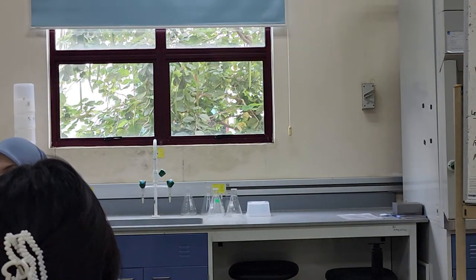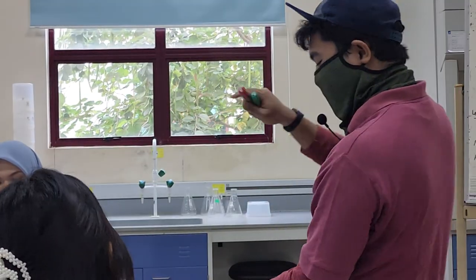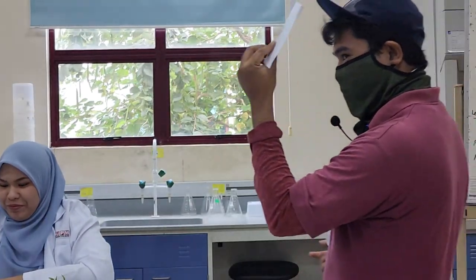So later on, with other organs, like a leaf, whatever you can take a surface imprint of, you can use your pencil. I used to have a very liquidy marker, so I'd color the surface and then get the imprint. But my marker is not that clear, so you're going to get something like this. This is the surface imprint of the papaya stem. It's more colorful this way. Be creative.